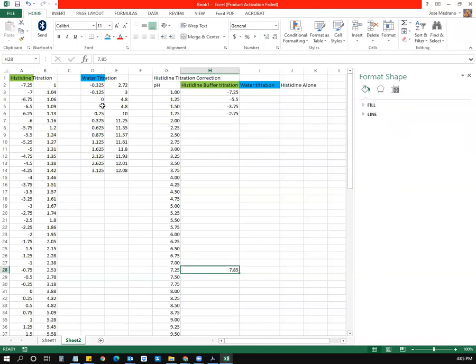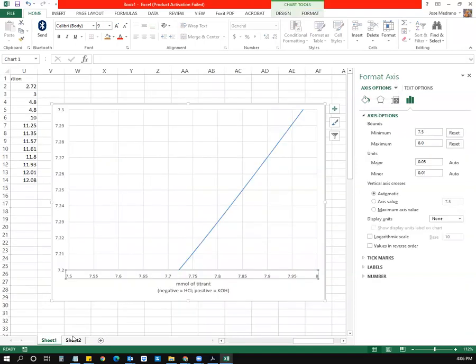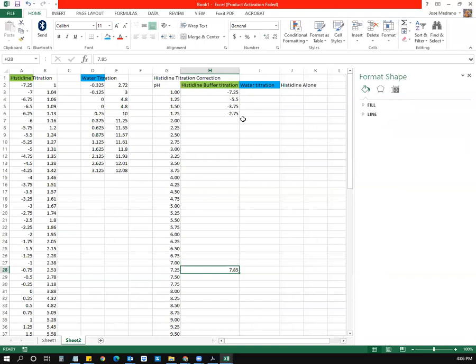to acidic or basic pH values very, very quickly. And so you want to make sure that, for example, adding 250 microliters of titrant here of KOH shot my pH to about 10. I'm missing all of this data here, but if I just zoom into these regions on the curve, I should be able to get better approximations of the amount of titrant at these different pH values.